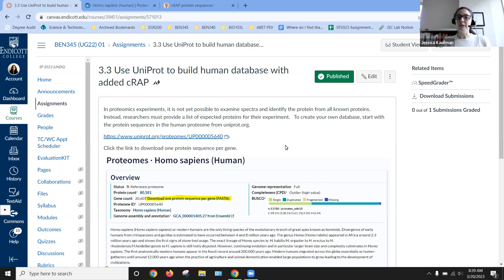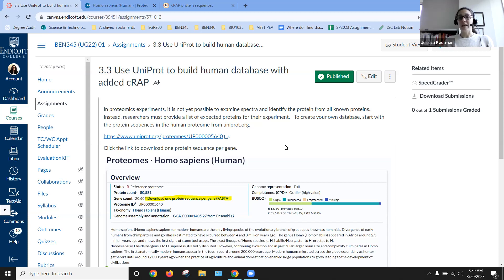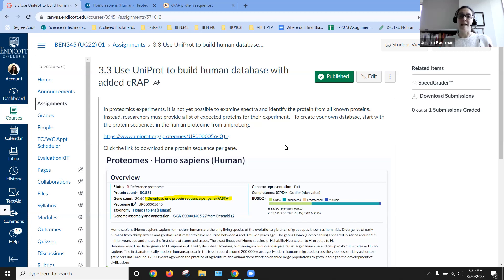Instead, what we're able to do is give the computer, give the software that's going to identify the spectra, give it a database of possible proteins that then can be on the computer simulated to be broken up into different peptides.